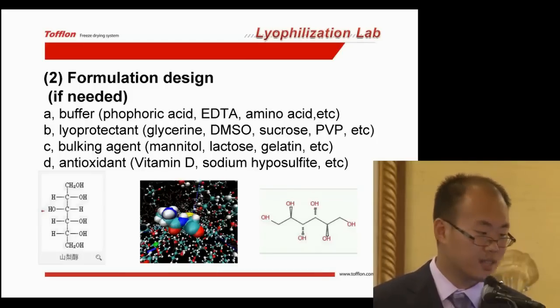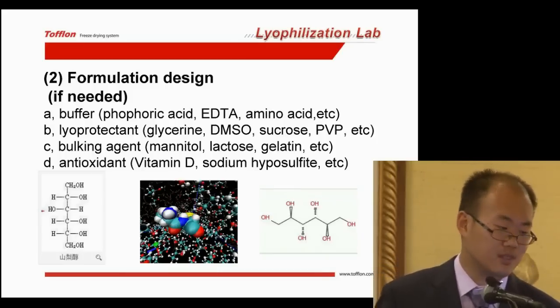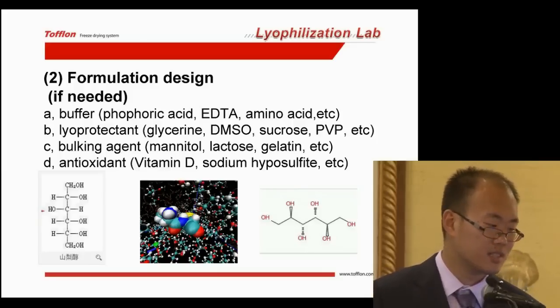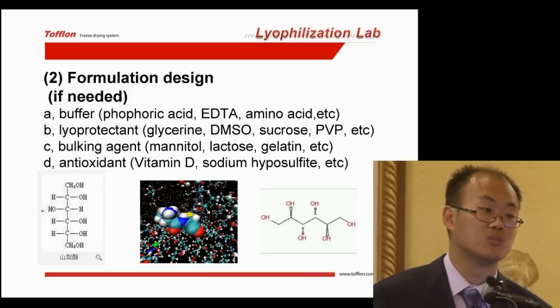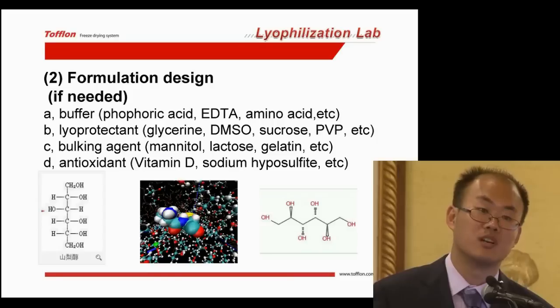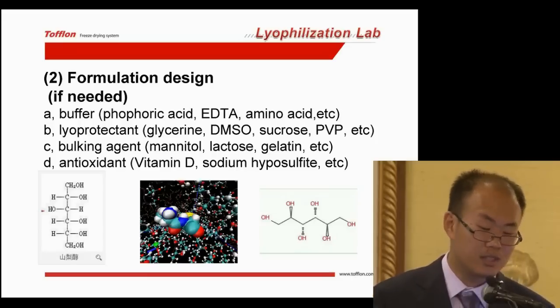So the second step is the formulation design. But it depends on our clients. If clients need this step, we do the formulation design. If the clients don't need this, we usually don't do this. The formulation design is usually also important. This formulation includes four parts.